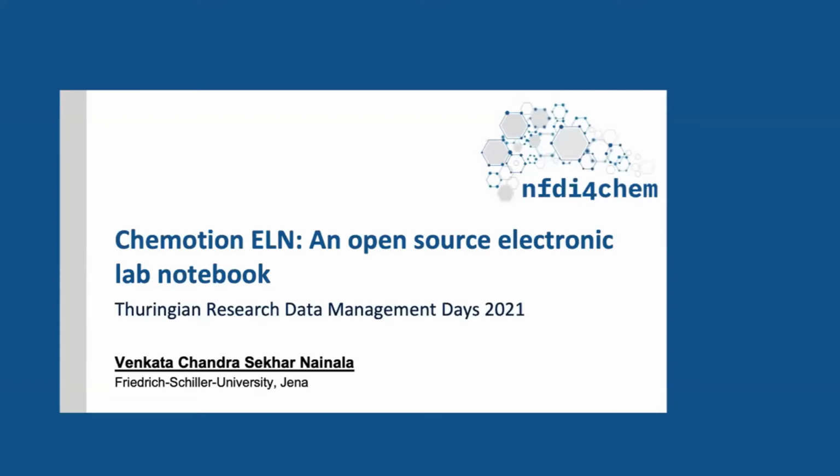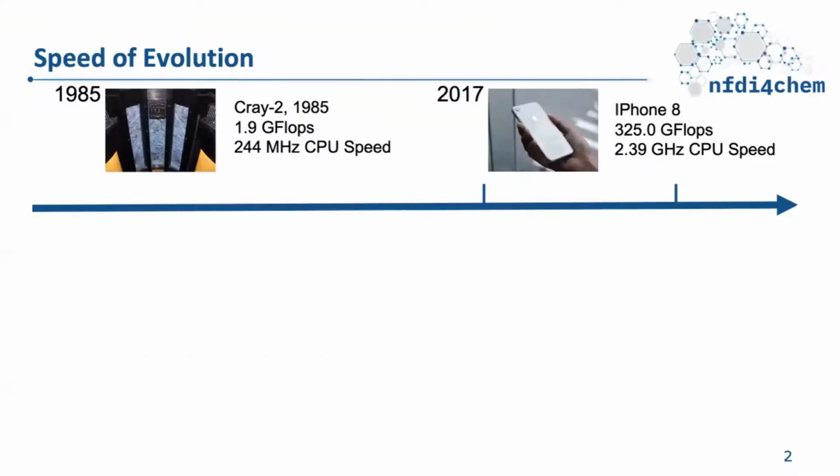Before I introduce what Chemotion is and also how Chemotion would fit into a bigger picture of the research data management, I would like to give a brief introduction on how the data capture or documentation within the lab setup has evolved over the years.